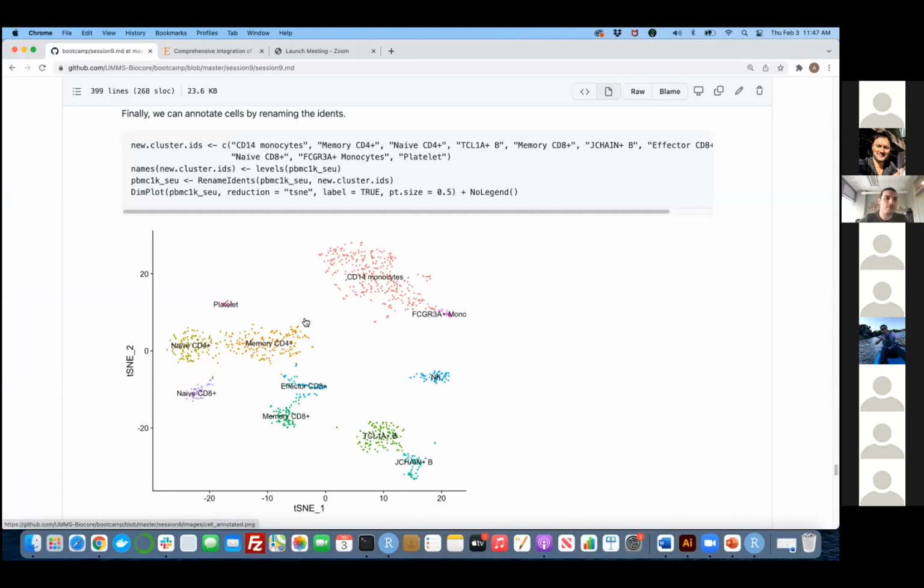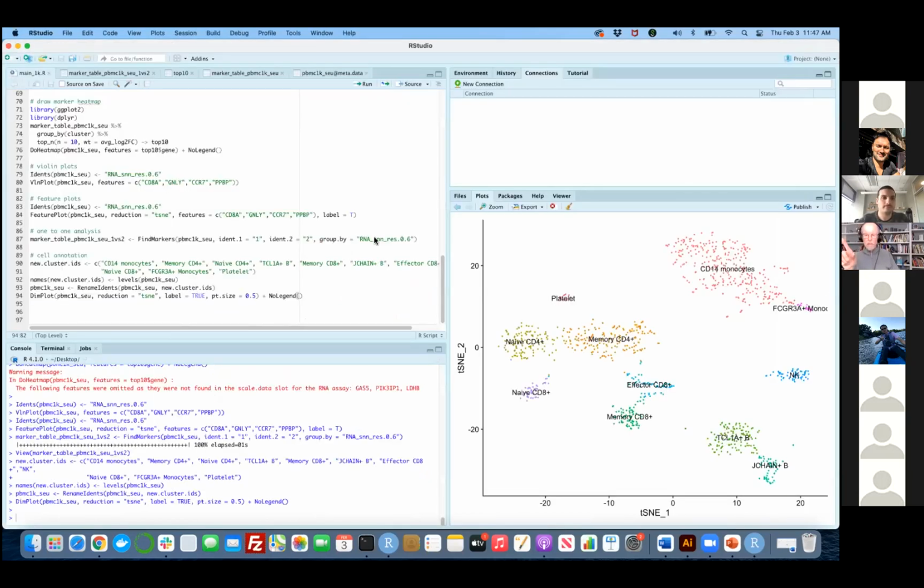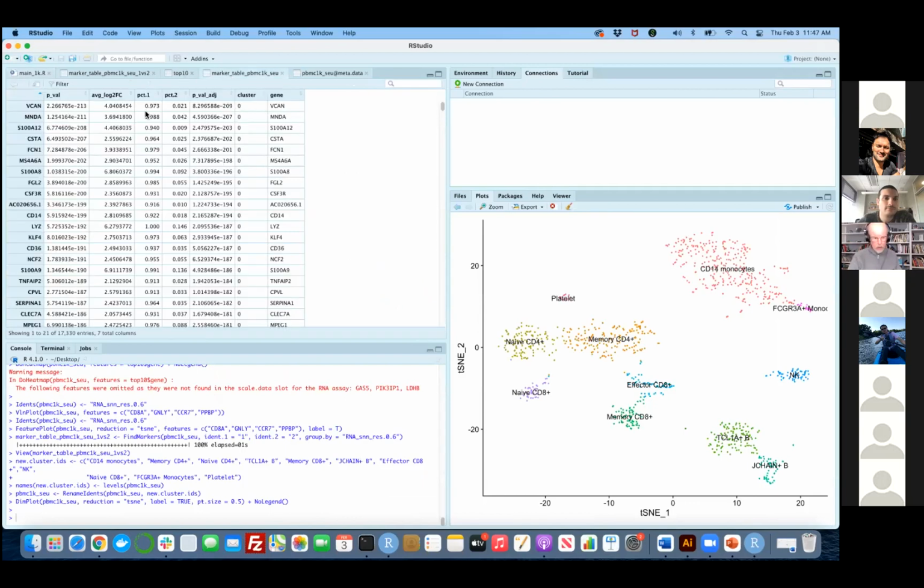So any questions before we finish? And I'm going to just talk about some other stuff too. I had a question, Arthur. So this is Bruce. On the table you had up a minute ago, which was genes within clusters. Yeah, that one. I'm looking at some of those p-values. They seem so extreme. I can't even understand what they're telling me. Like the first one, 10 to the minus 209. I mean, what is that even telling me?